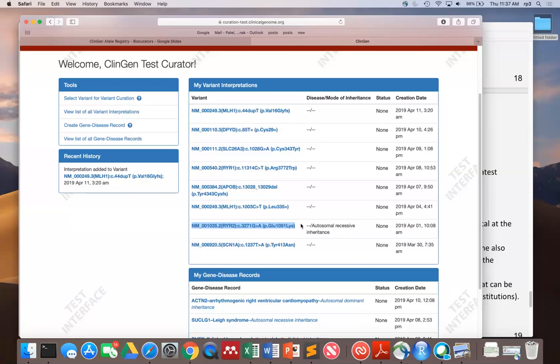Great. Sorry, I was going to add to that. At the moment, if you're looking at a variant title, as Stephen was saying, if it is in ClinVar, then we show the ClinVar preferred title for that variant. But the issue is that if there isn't a designated transcript, because when it comes in from ClinVar they've already designated a transcript, which is why they're able to generate that title with the change and everything. So currently, if we can get a single canonical transcript from Ensembl, because they show a canonical transcript via an automated method as well, then we show that, and we construct a ClinVar-type title based on that canonical transcript.